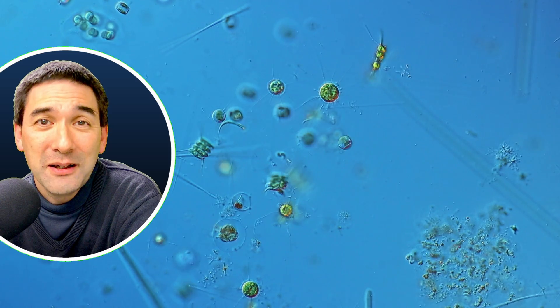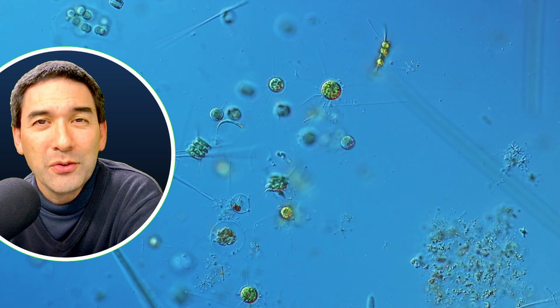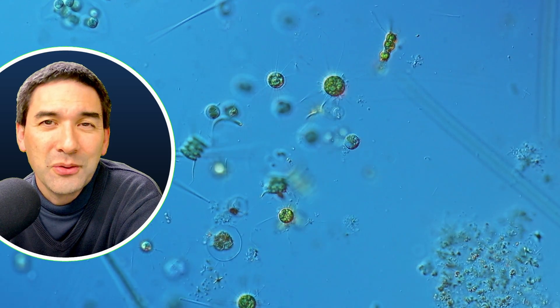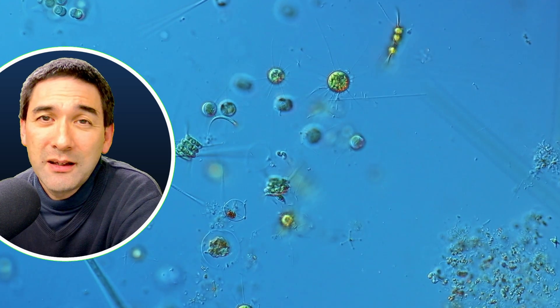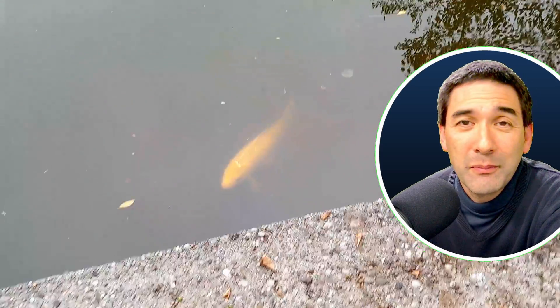And again, another place under my microscope slide. And I was able to see also some of those algae — probably Scenedesmus or Desmodesmus. These are also some very common species that you can find in pond water. I expect the composition of the algae to change over the course of the next couple of months, of course. And this one here, that's an easy one to identify — that's a fish also living happily in the pond there.